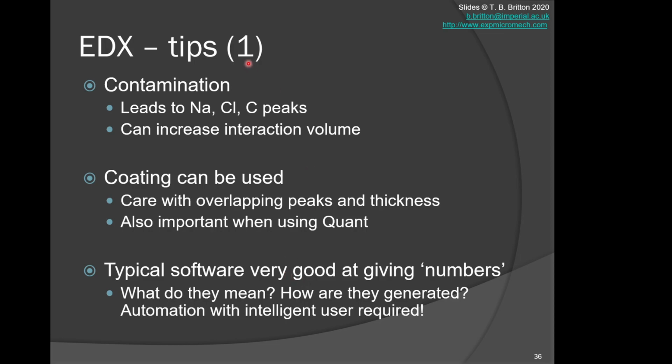So a few tips when doing EDX. First off, be careful about contamination. You will get from sweat, you'll get NaCl being produced, and that will deposit and you'll see those peaks. You'll also get hydrocarbons from oils on your fingers. They'll crack and change the carbon chemistry, as well as other mess and things. So clean samples, wear gloves, etc.